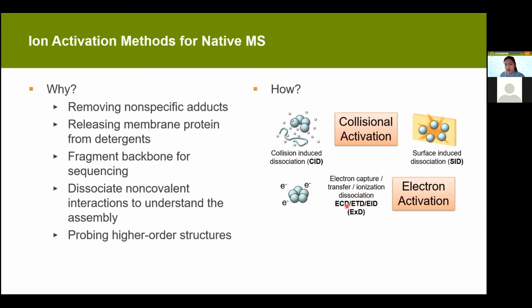And all those, we just call them ExD, basically electron-based activation. It's commercialized in some instruments, but typically you still require some modification. There is a company called e-MSion who has commercialized this device as an add-on to other commercial mass spec platforms.